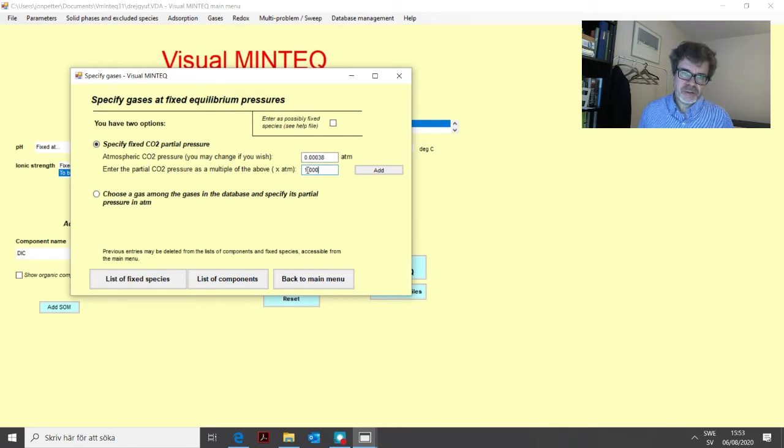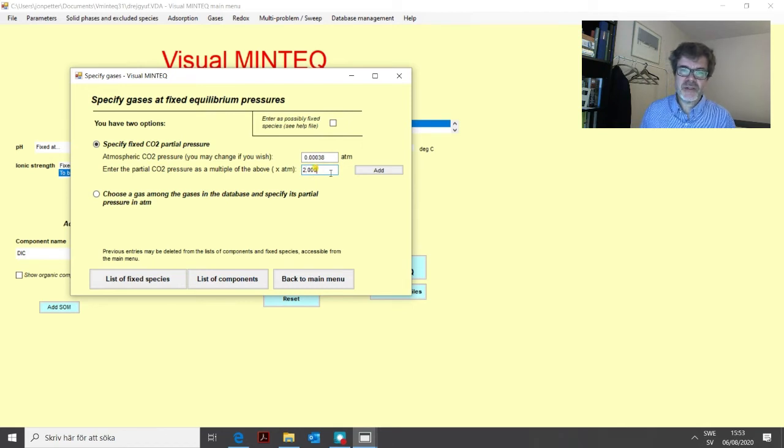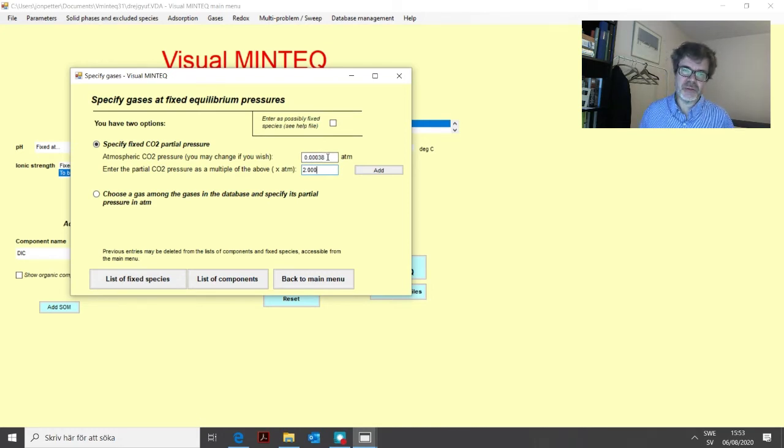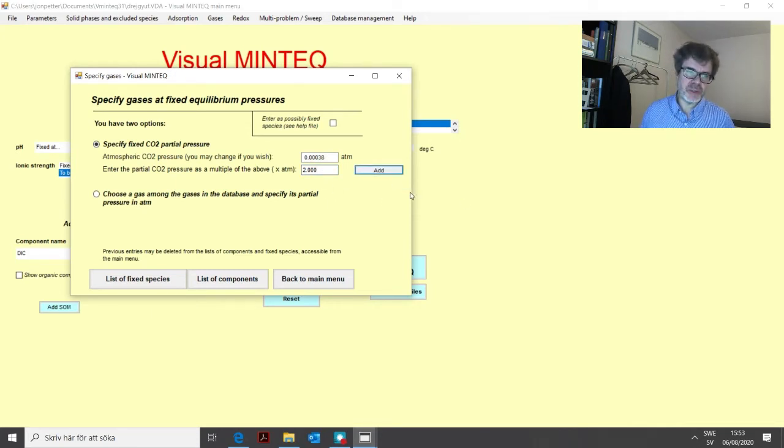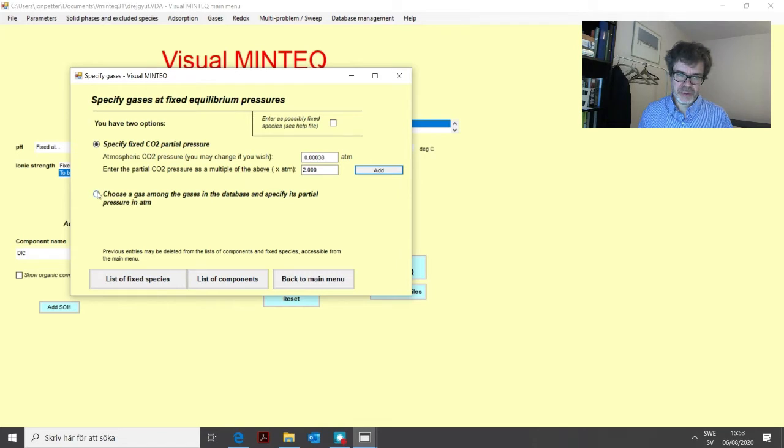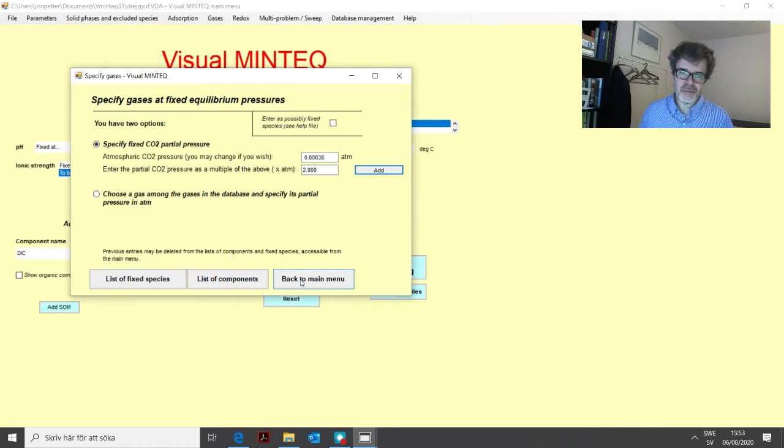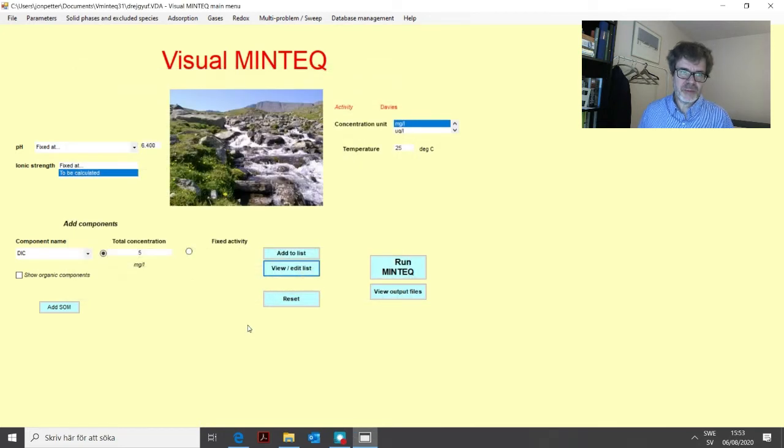The second text box here is the value you have that defined as a multiple of this first value. So if you have a CO2 pressure two times the atmospheric pressure, you change this text box to 2. And so the final CO2 pressure will be the product of these two, this one times this one. And then we can click add here. Now CO2 is present in the problem. Here you can also see that if you have another gas in your system, you can enter this here as well. We go back to the main menu.